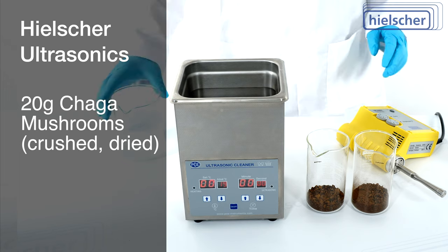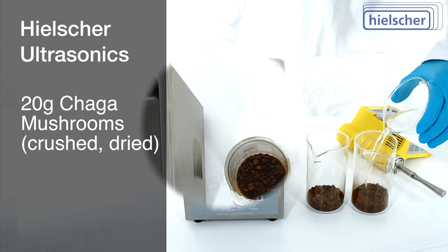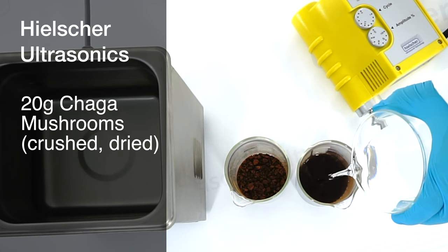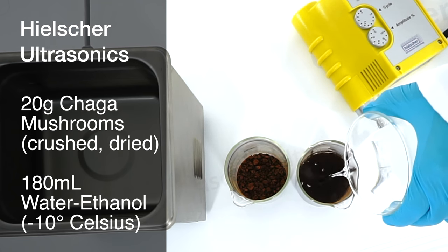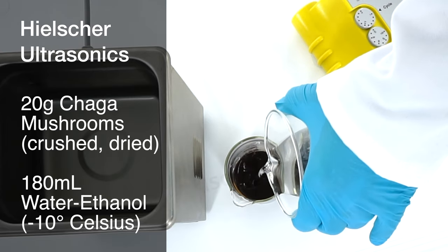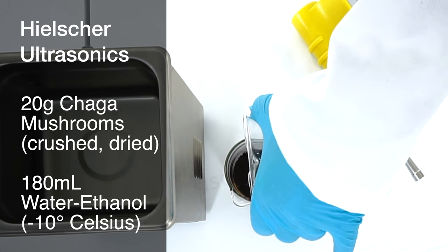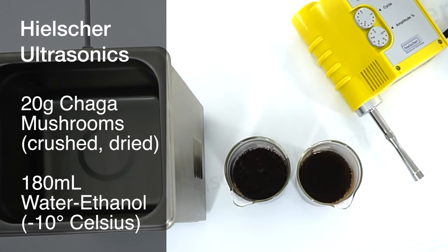For this demonstration, we use two identical beakers. Each beaker contains 20 grams of crushed dried chaga mushrooms. We add 180 milliliters of cold water-ethanol mixture. A higher alcohol concentration improves the solubilization of water-insoluble components, such as betulin, betulinic acid, or phytosterols.